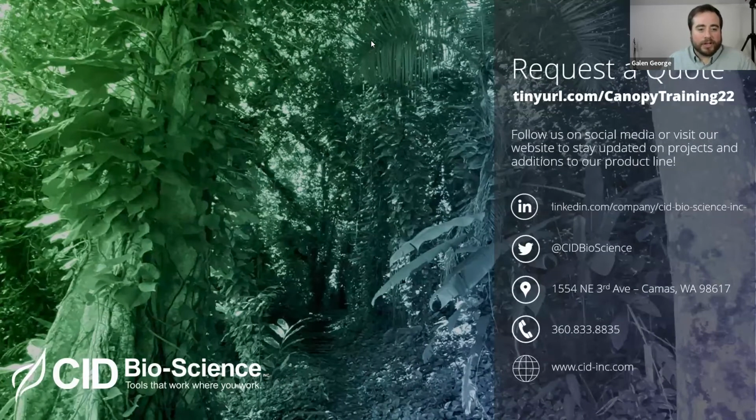The next question is, most of the new orchards are quite two-dimensional. How does it work for the calculations when the canopy is not three-dimensional? We have had people use this in orchard applications with some success. Something I forgot to mention earlier is we have a great webinar that we did with 3 different users of the CI-110.